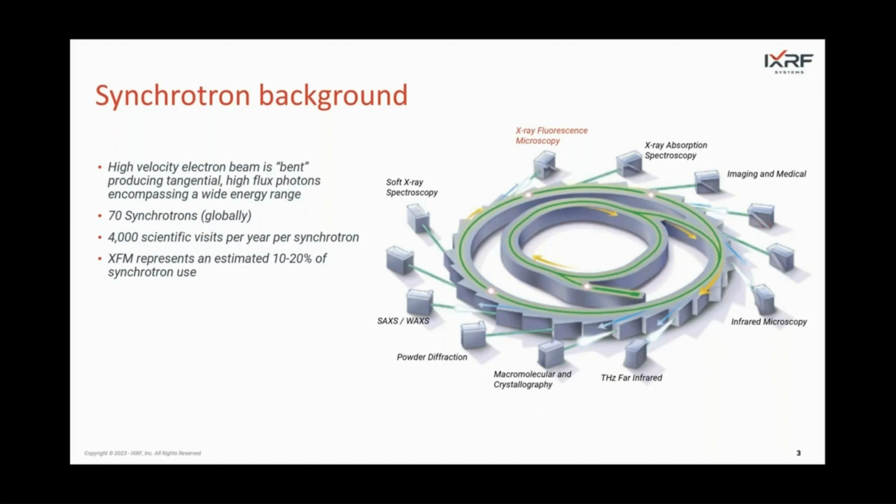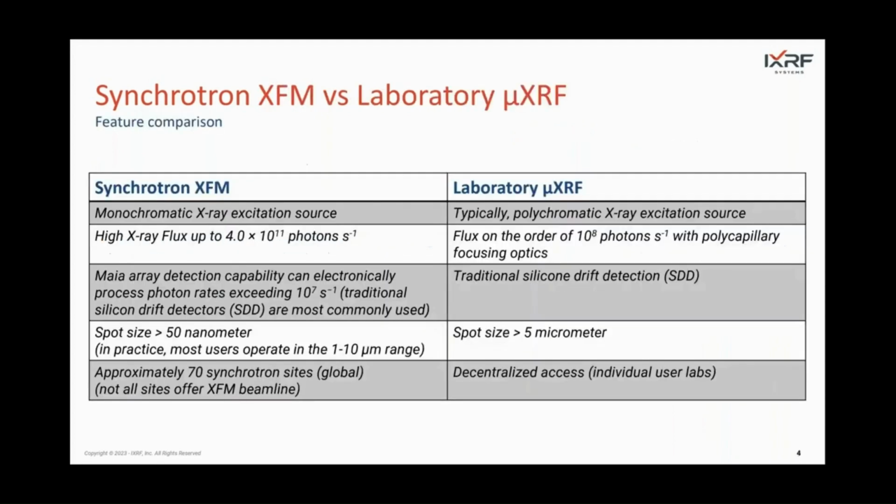These fluorescing X-rays are quantified using a detector located either perpendicular to the incident X-ray beam or in a backscatter geometry. Accessible elements depend upon the configuration and capabilities of the beamline and the energy selected, but these range typically from 2 to 25 kilo electron volts, or from phosphorus to silver at their K energy transitions, and higher Z elements at the L energy transition levels.